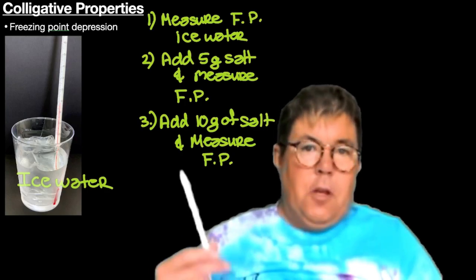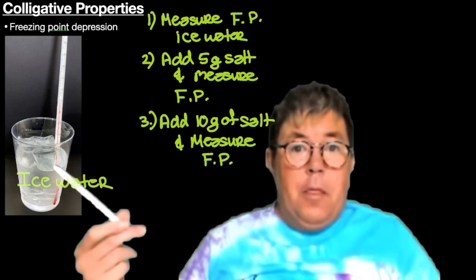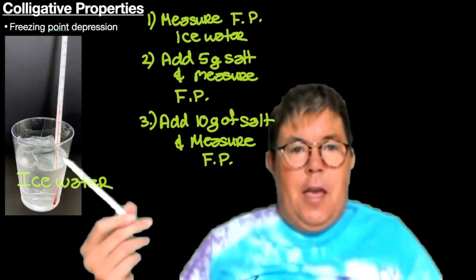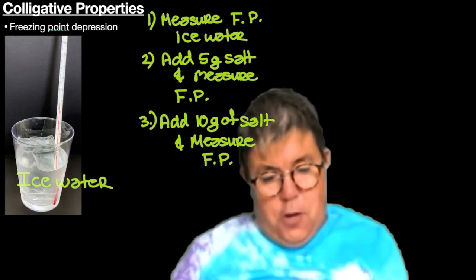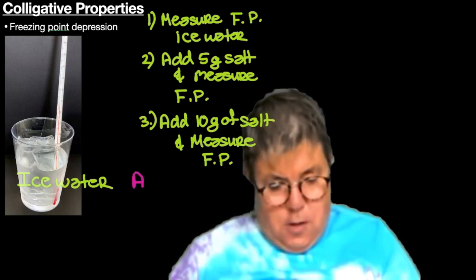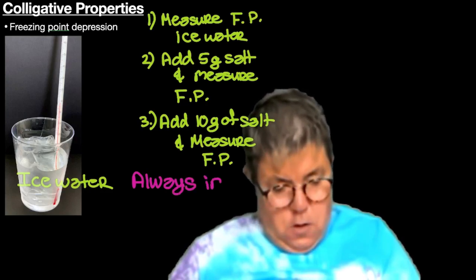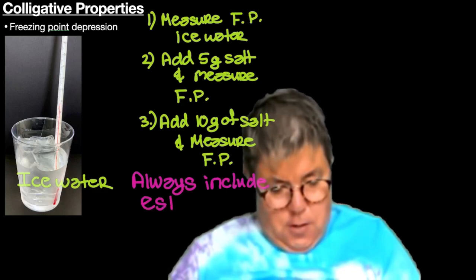So we're going to record temperature over time until the temperature bottoms out and does not get any colder. Remember, we are measuring, so always include the estimated digit.